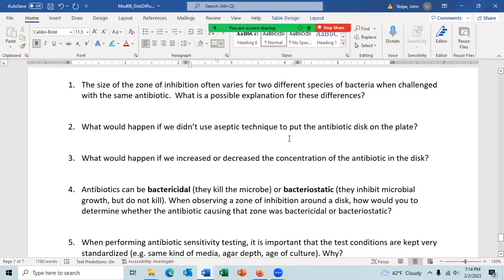And you should explain it in terms of the Kirby-Bauer disk diffusion result. Meaning if you just tell me, if I don't use aseptic technique, I will get contamination. That is correct, but it's not talking about the Kirby-Bauer test. What will happen to the test? So tell me about that.